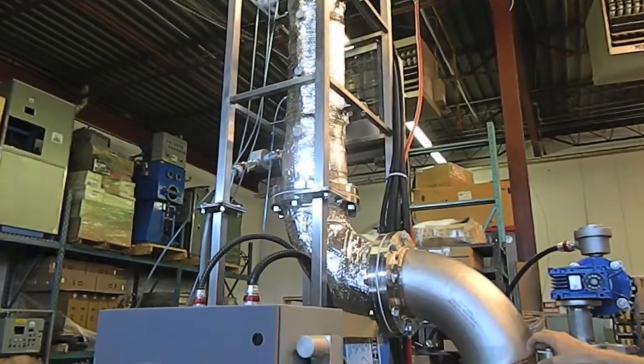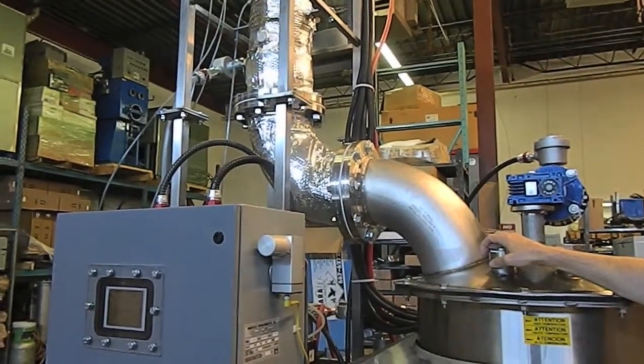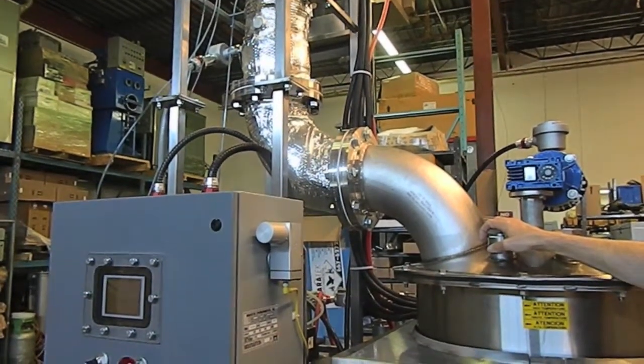Typically the ROIs are less than a year for this equipment. They're safe to operate, very automatic, very efficient, and they really do the job.